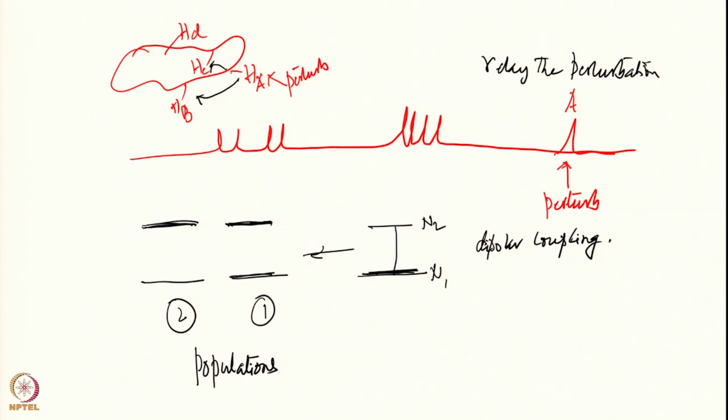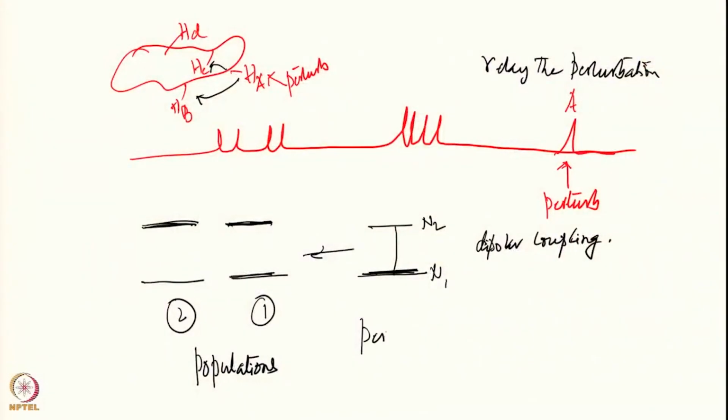Okay. So that is like a relaxation phenomenon. After you change the populations, the system will have to recover. How does it recover? It has to give away its perturbation to somebody else. So the perturbed populations have to recover.